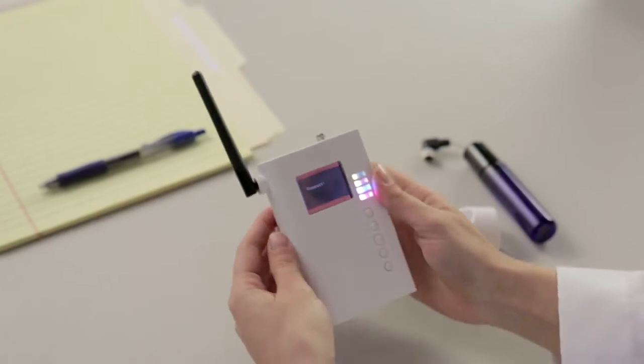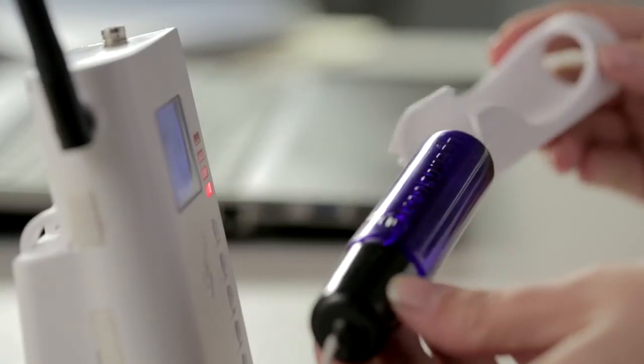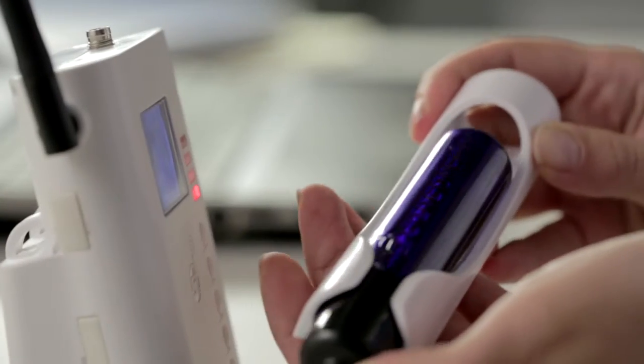Also included is a glycol vial for instances when you need to monitor the temperature of a solution in the environment instead of the air. It's easy to slide the vial into its compartment and attach it to the side.